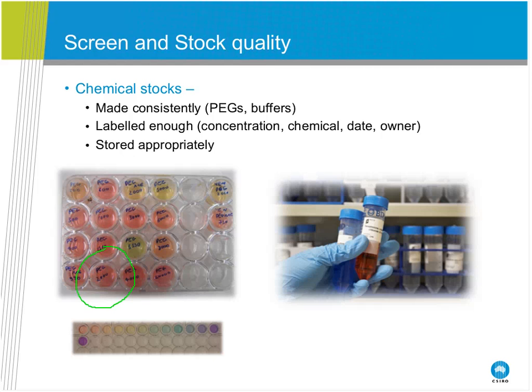Then we wondered whether it was the stock that had gone acid or whether it was actually the PEG solid that went acid. So we used the same solid, and we made up another solution, and we found out that that was actually really quite neutral. And this pink one, the acid one, was only about 6 months old. So ever since then, we have a policy that we keep our PEG solutions in the dark, in the cold, and we throw them out after 6 months, because we want to make sure that we have some consistency in how things behave.